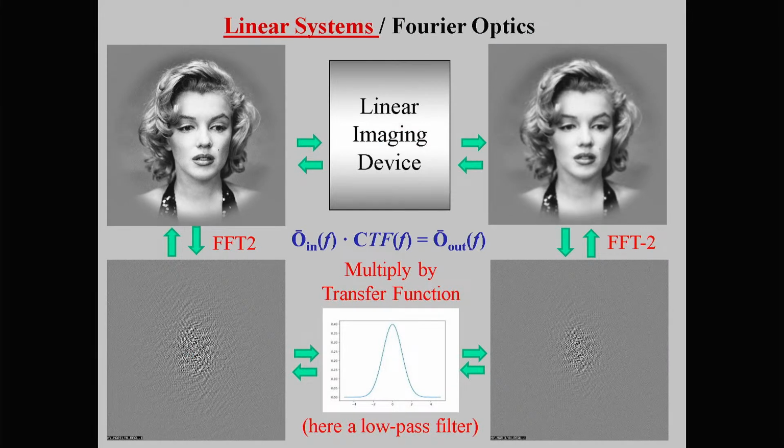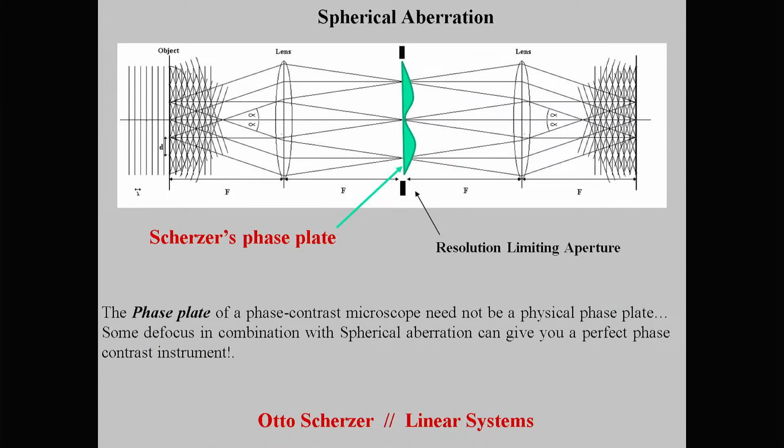This is deterministic mathematics. That means that if you know the object, you know it deterministically, with infinite precision. And you know the output with infinite precision. You know the transfer function with infinite precision. And then everything just works, this is deterministic mathematics. It goes both ways. It's very unintuitive, but it allows you to do that.